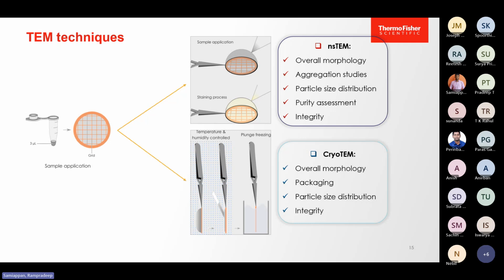So all these steps you can do in a very quick manner. I would say if you have a sample ready, you can get the results within a day, or within half a day, for example. You can do at least 3 particle types or 3 samples in an array, or even more actually. It's that quick, and you will get a basic idea of how your samples look. The next step is cryo-EM.